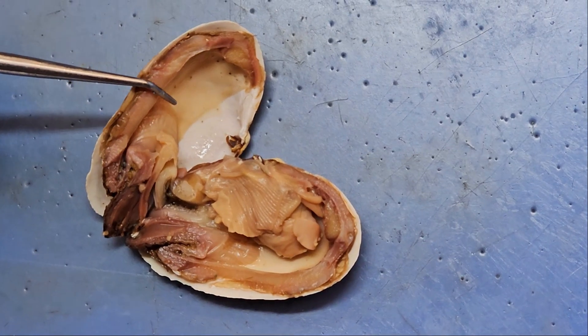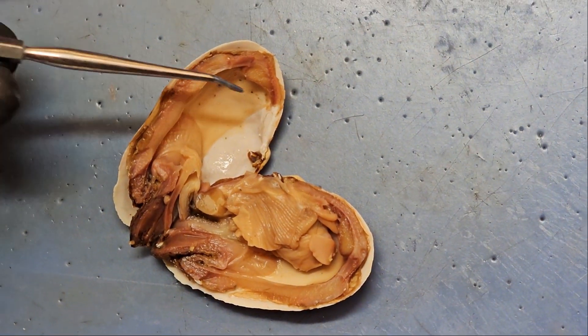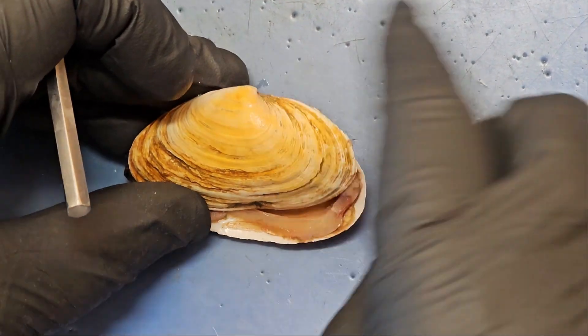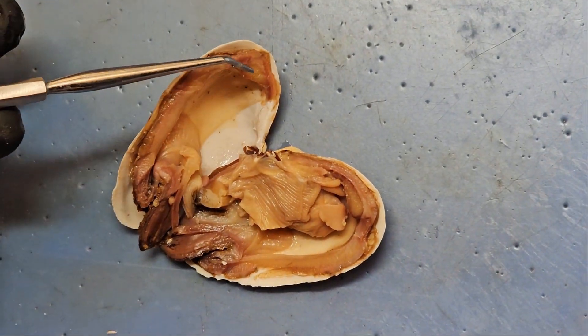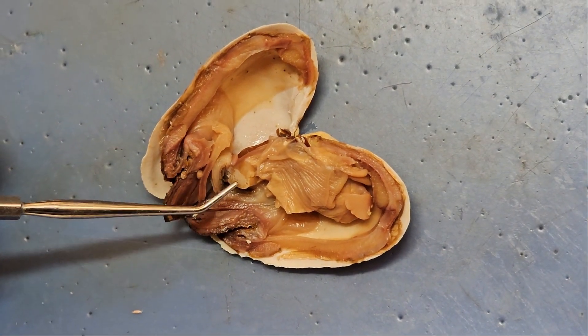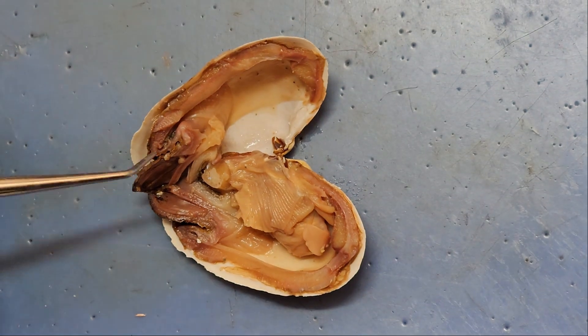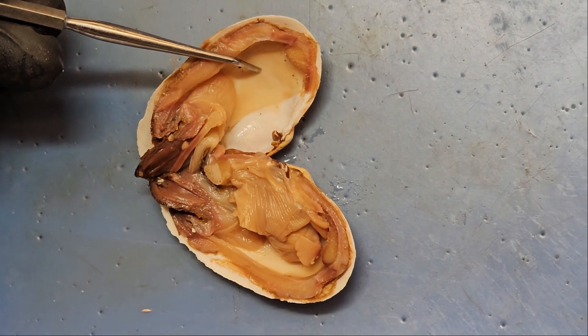Now over to the clamshell proper. This is the dissection — we've taken our scalpel, we've cut the anterior adductor muscle and the posterior adductor muscle. In doing so we've opened the shell. We've also cut through the incurrent and excurrent siphons, and we've exposed this real thin thing called the mantle that lines the shell and creates the shell.